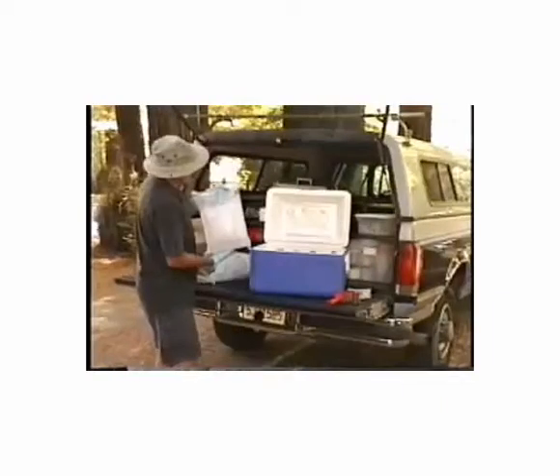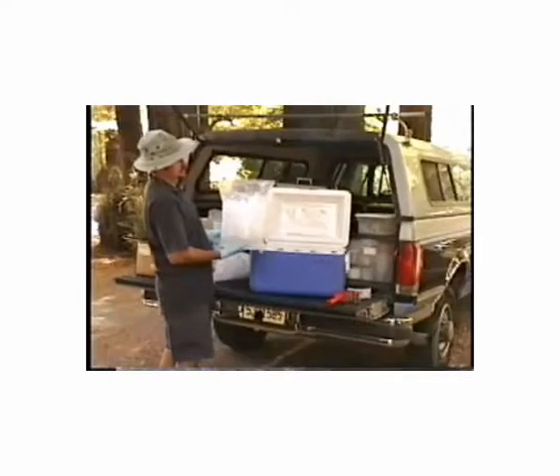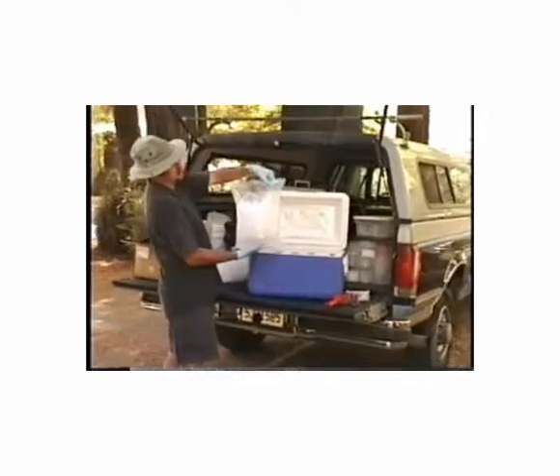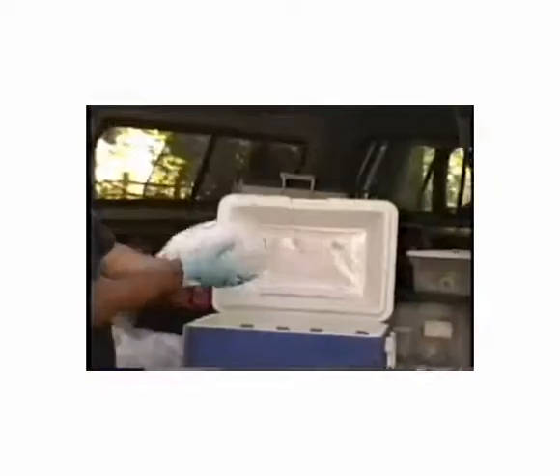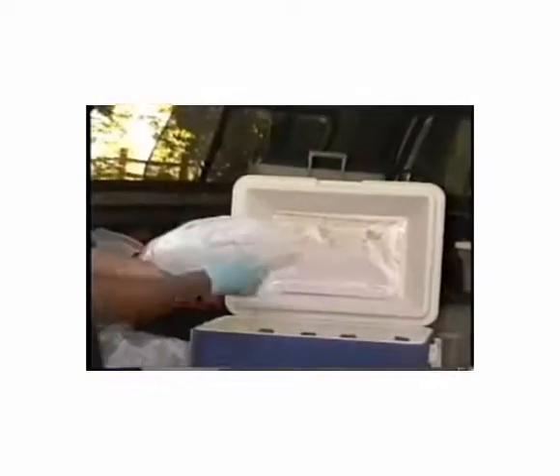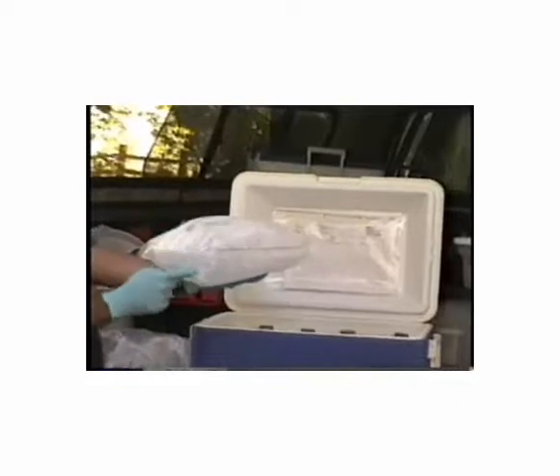We then double bag our ice, making sure that no water or ice is going to leak out of this bag. As you can see, I have one end of the bag on the top here, and then I also have the other inner bag with the top inside the outer bag.